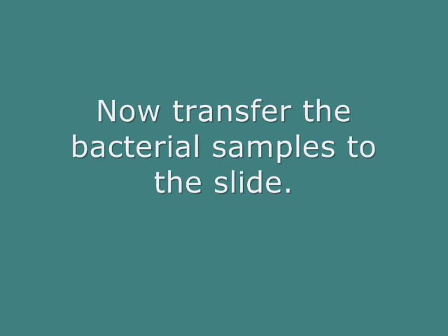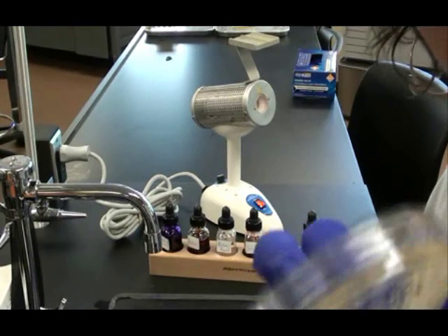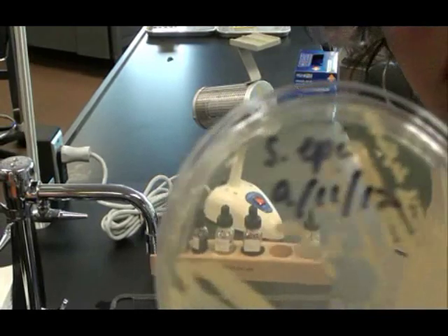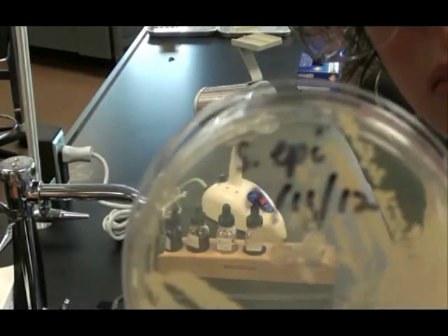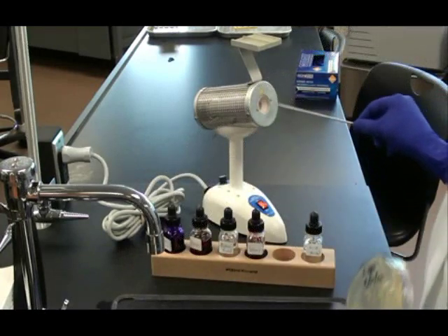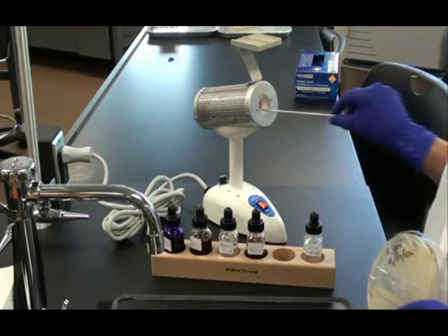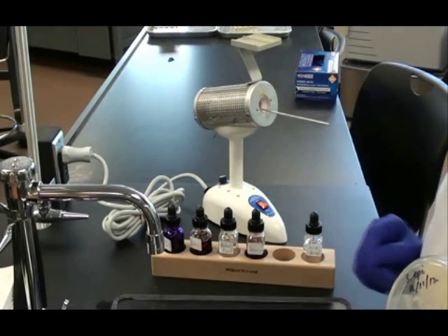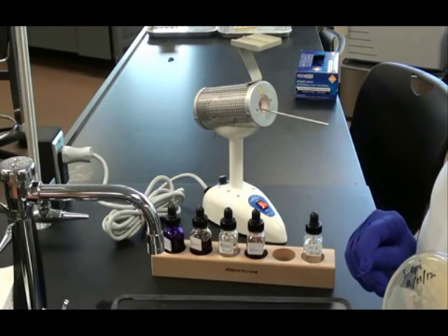Now I'm going to transfer my bacterial samples to the microscope slide. I'm going to start with my positive control, Staph epi, or Staphylococcus epidermidis. I use Staph as my positive control because it is a known Gram positive organism that I can compare my unknown to.